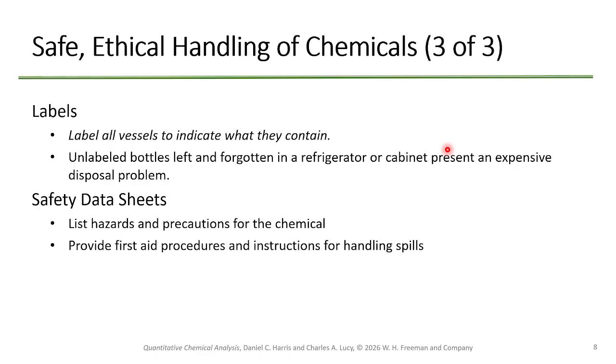That's kind of expensive and unnecessary. Yeah. But alcohol is usually all throughout the lab. The isopropyl 70% works fine. But ethanol, methanol, those all work too. And it's cheaper and usually less hazardous around the lab. Okay. What else do you need?